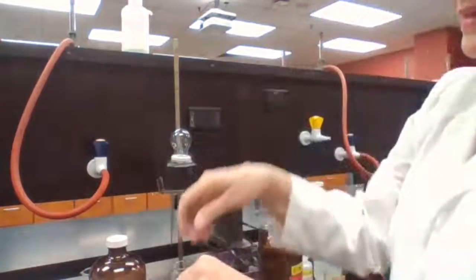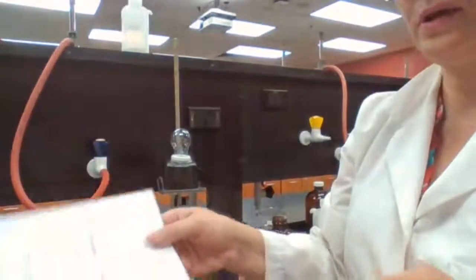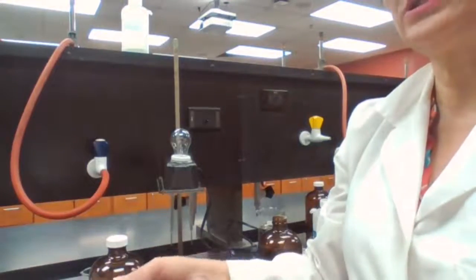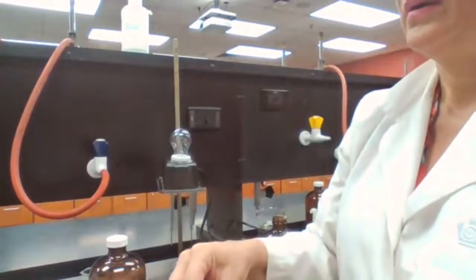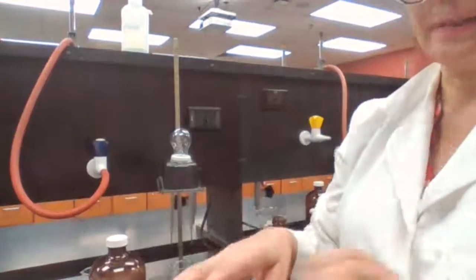So we are done with that table with the list of substances we want to know if they are electrolyte or not. We are going to complete the data sheet using those, and we want to test other aspects.